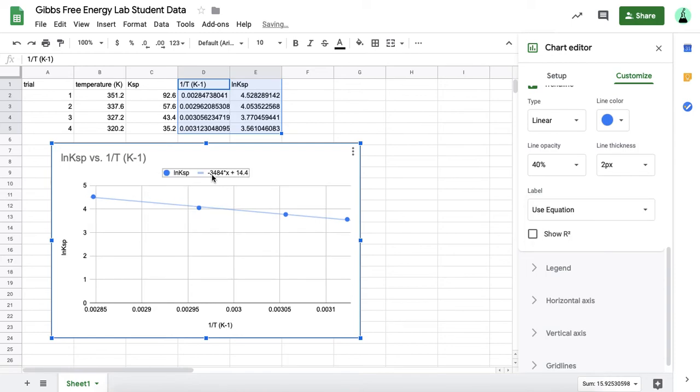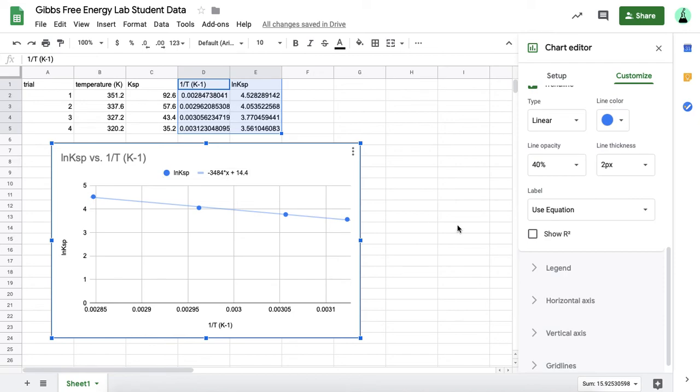You need this because you need the slope, and you need the y-intercept to calculate your enthalpy and entropy. This is really valuable here, you want that to show. And then it's also good to show the r squared.